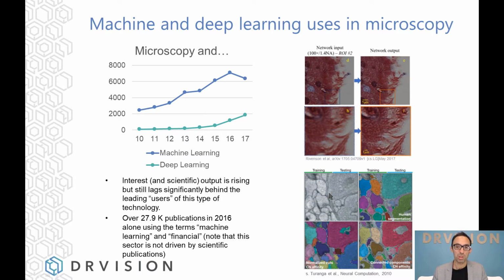And that's probably one of the reasons why researchers have, in this field, the field of connectomics, they started to use deep learning to explore the possibilities, because it's definitely showing some good results.